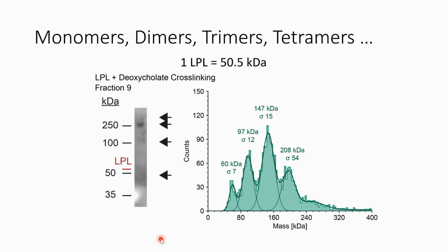So this obviously really drove home to me that the deoxycholate was not what was playing the crucial role in determining the oligomeric state. And indeed, you can see here the appearance of a small shoulder, suggesting that potentially we're also moving on to pentamers and even higher order oligomers in the presence of deoxycholate and this increased concentration that we were able to use for the gradients.